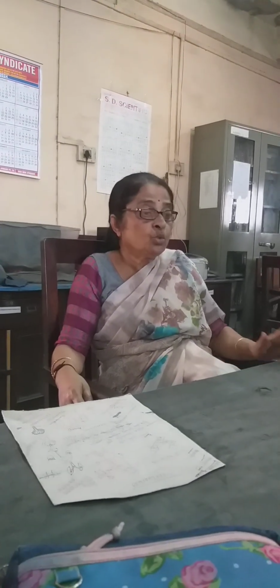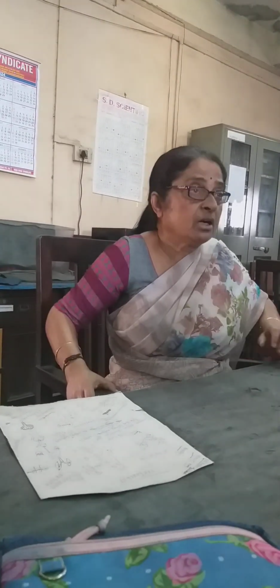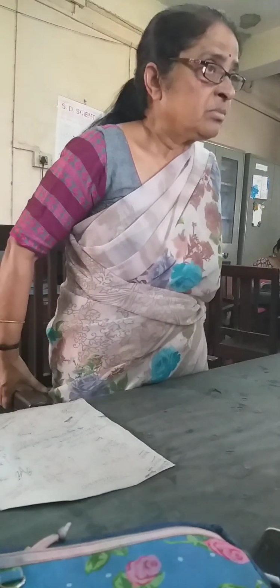So now, today we shall do the rhizomatous drug. আগের দিন আমি বলেছিলাম দুটো রাইজোম তোমরা এনেছিলে, কী কী সেই রাইজোম? আদা আর হলুদ, জিঞ্জার। শোনো, বাংলায় বলবে না, you must start to tell the scientific name because when you are going to identify the drug, I have already told you that it must be taxonomical in its expression. তাহলে ট্যাক্সোনমিটা আমরা কখনোই বাংলা নাম ইউজ করলে কেউ চিনবে না। You have to always in the viva table also.